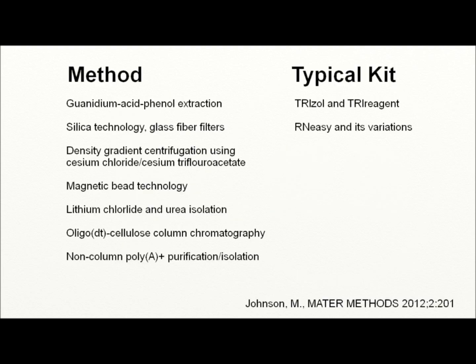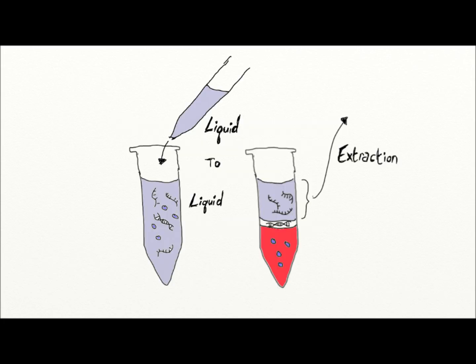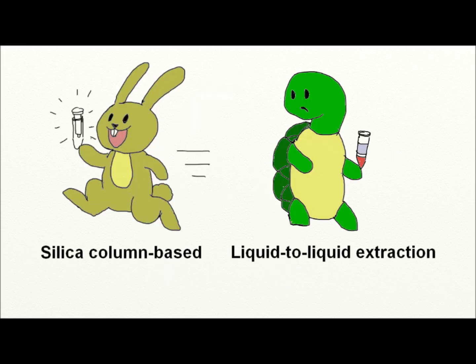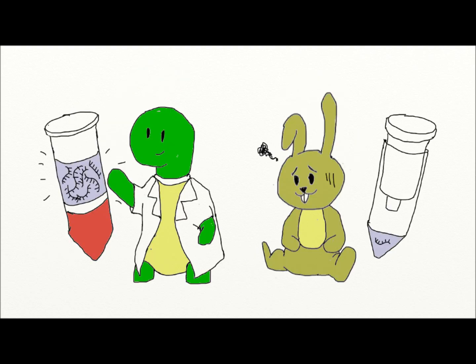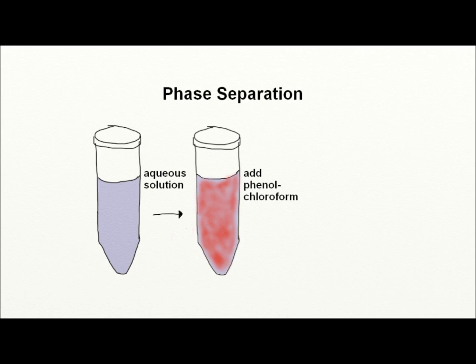There are several methods to extract RNA from samples, but the most commonly used method is guanidinium thiocyanate phenol chloroform extraction, or more commonly known as trizol extraction. This method is a liquid-to-liquid extraction method, which may take longer than a silica column-based method, but has a higher recovery of RNA. This technique works because it relies on phase separation by centrifugation of an aqueous sample mixed with a solution of phenol and chloroform.